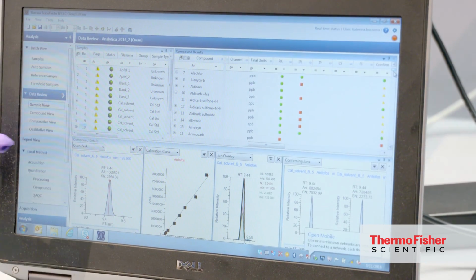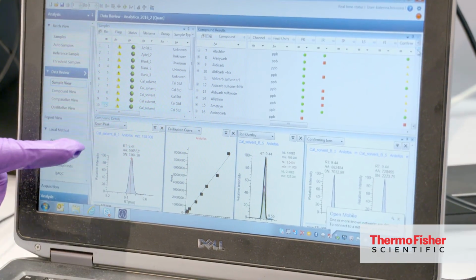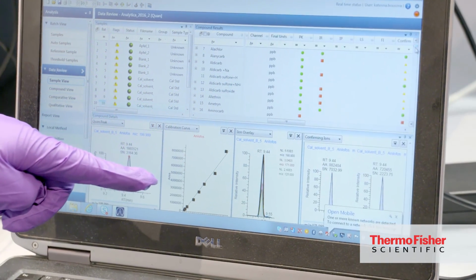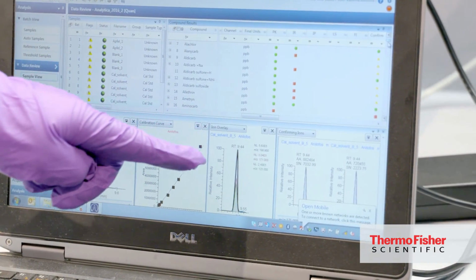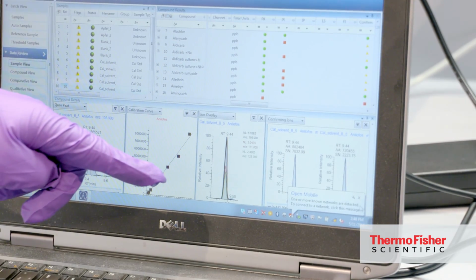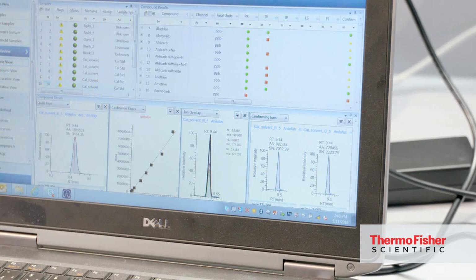And also you have the flagging system, but more interesting is really the pictures showing the quantitative peak, the calibration curve, the ions, the confirmation ions overlaid with the main peak. And you see also the confirmation ions in a separate window.